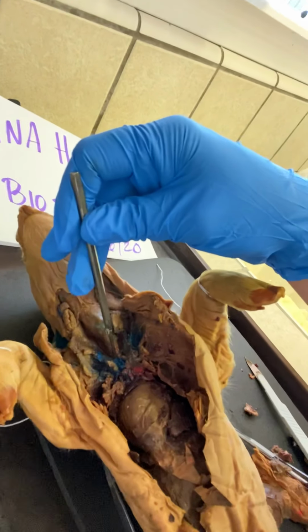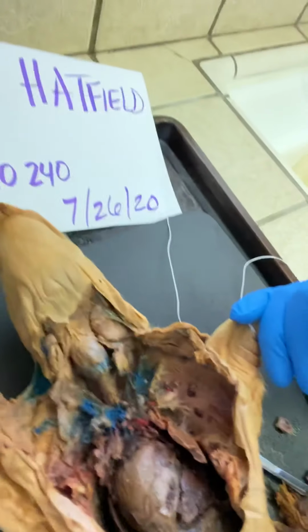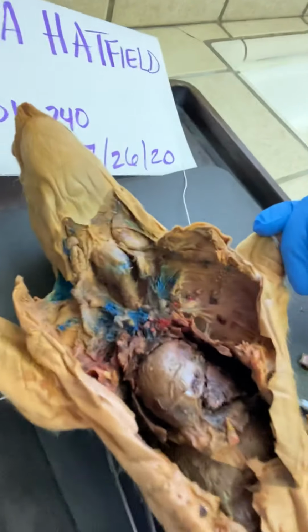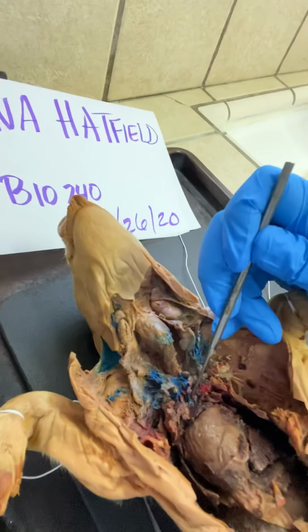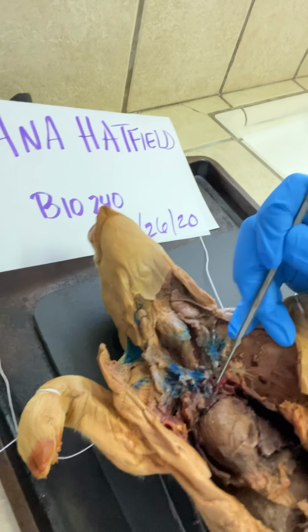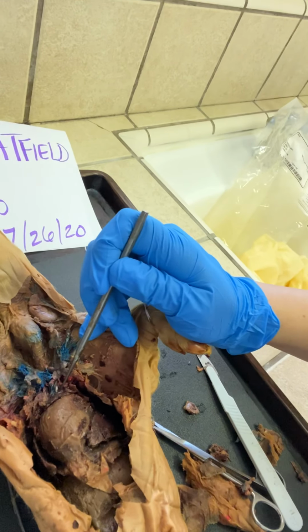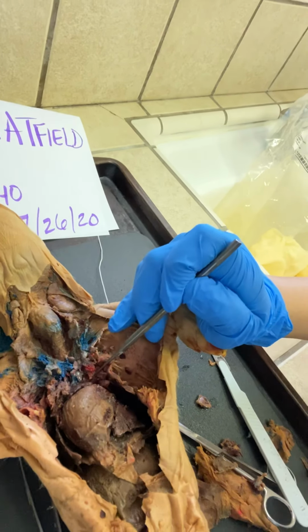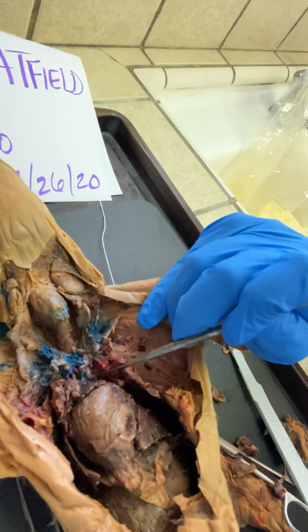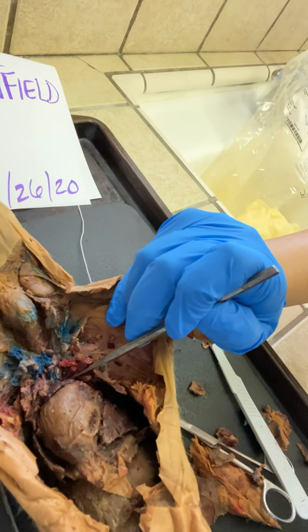I think it's called subclavian because it's right by the clavicle, kind of. Let's see. Also, we have the aorta. I already mentioned the aorta is here. You can hardly see it. It's really messy in here. But the aorta is here, along with the pulmonary arteries, which are very close. I cannot visibly show you guys because I've been having such a hard time dissecting this, but I know that it sits next to the aorta over here.